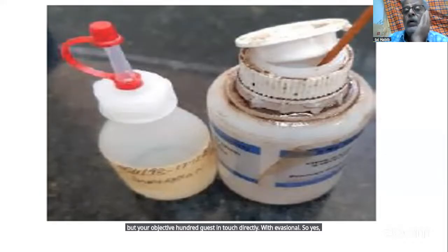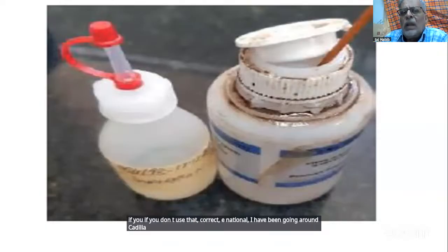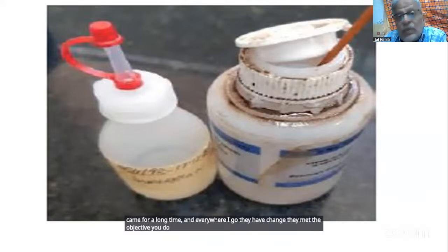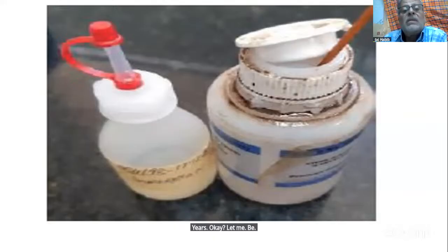So if you don't use the correct immersion oil, I have been going around Kenya for a long time, and everywhere I go, they have changed their objective. You don't need to change your power objective 100 for almost 10 years. Okay, let me be realistic, up to 5 years. It doesn't fail. So if it is failing within a year, you're using the wrong oil for sure.